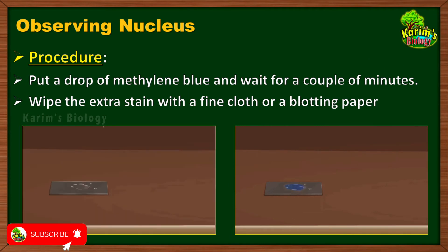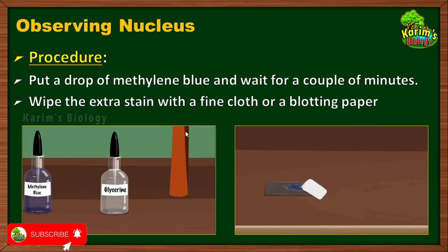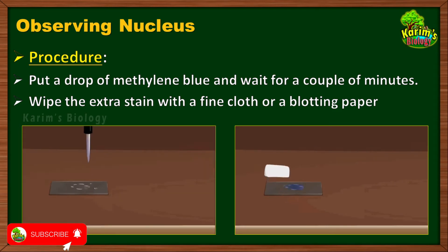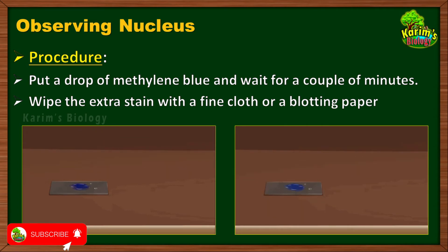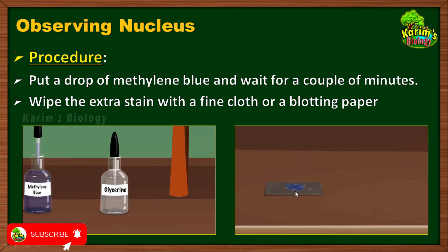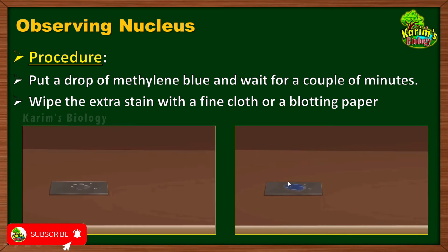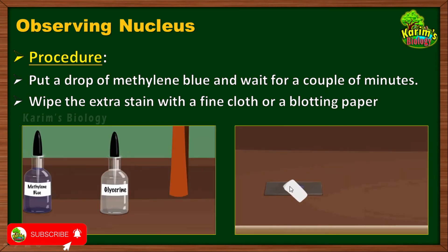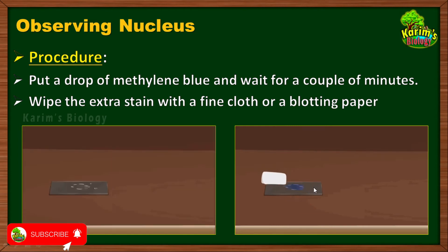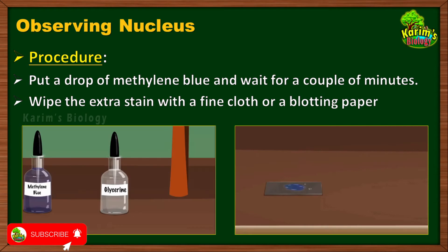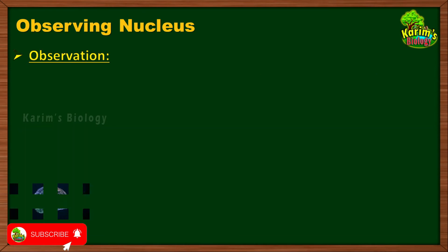Afterwards, wipe the extra stain with a fine cloth or blotting paper. Since we have already added some water and then added stain, the quantity of liquid over the specimen may become excessive. To remove this, apply a blotting paper at the margins of the slide so that excessive stain and water are removed from the specimen.